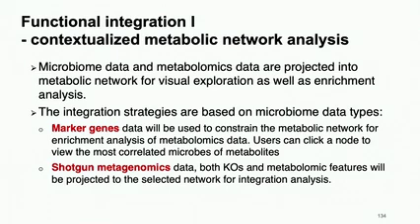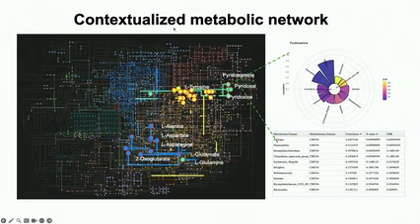In MetaboAnalyst, we actually allow you to have proteomics or genes together with metabolites to join the pathway analysis. But on the other part, we can use a genome scale metabolic model to predict how likely they can generate metabolites. So here's something we call the contextualized metabolic network. If we know certain species is present or not present, we can filter the general network. Some pathway reactions will be present because you detect them. If you didn't detect them, make it grayed out or totally hide them.